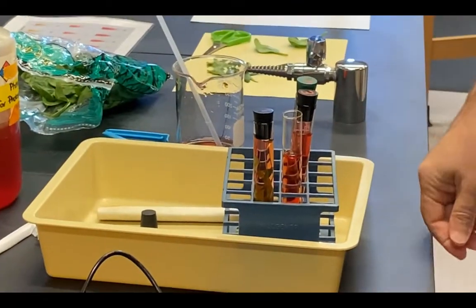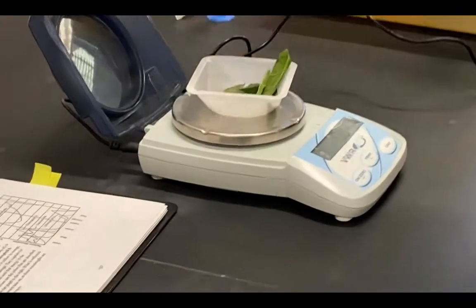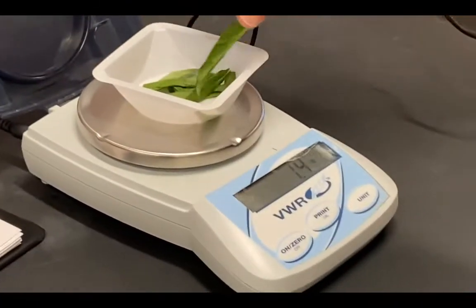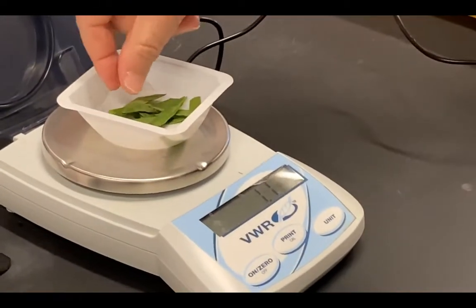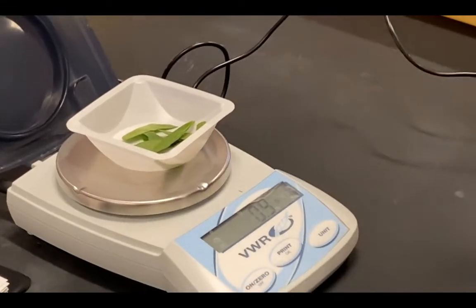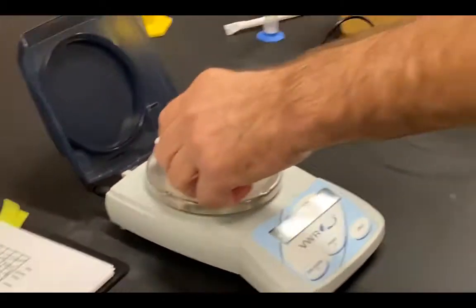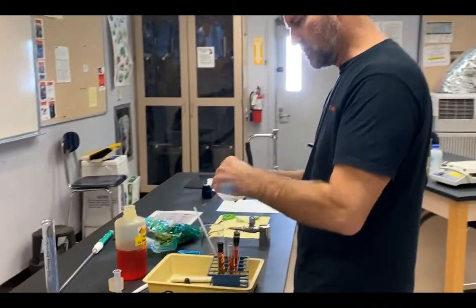I can weigh out spinach for my next tube. It's a little heavy. All right, there we go. I'll put all of this in tube number 2.